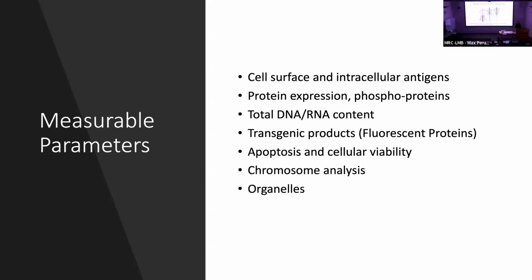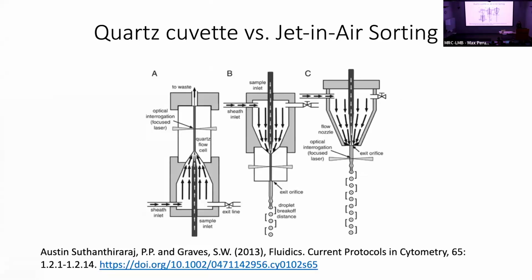All right, so moving forward, I'm going to start talking a little bit more about cell sorting and how it works. We have different systems available in the facility. The first is under the A plot here, or A figure. This is just showing how a typical analyzer works.